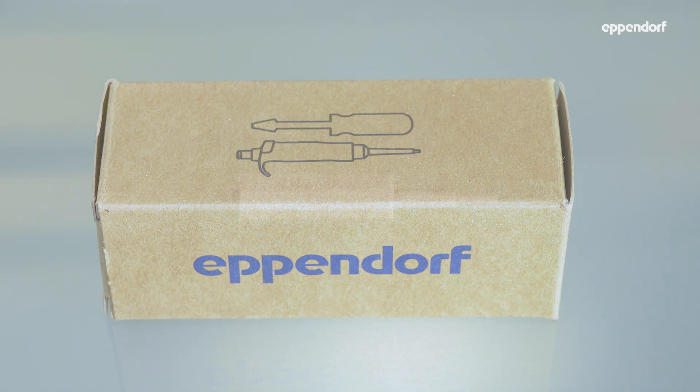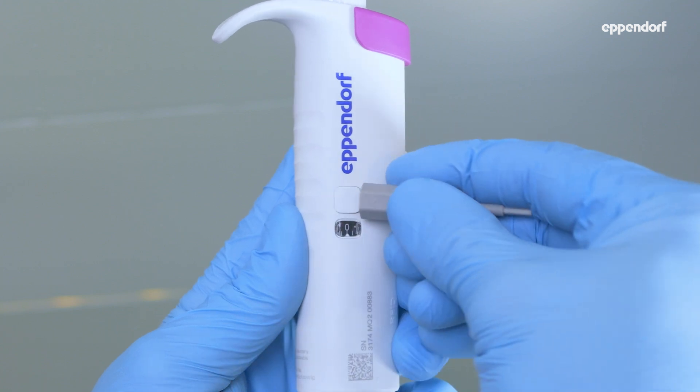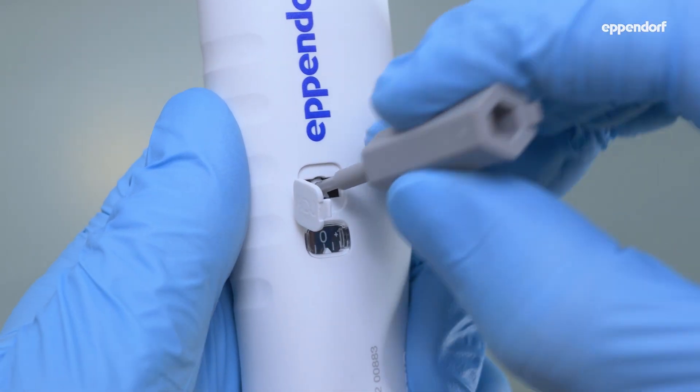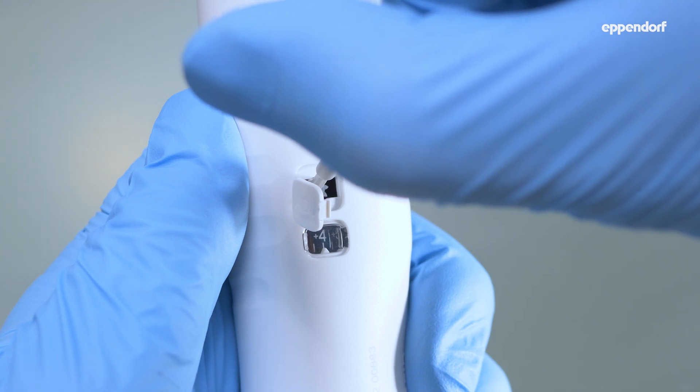Use the adjustment tool that came with your pipette to open the temporary adjustment cover. Insert the adjustment tool in the gear wheel and rotate it until the scale shows the desired value.